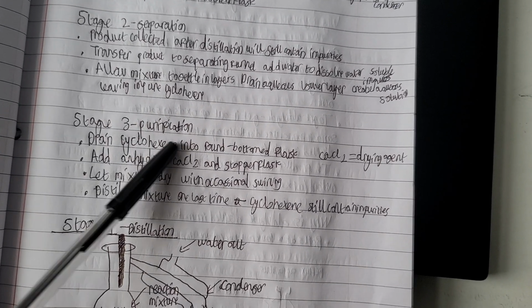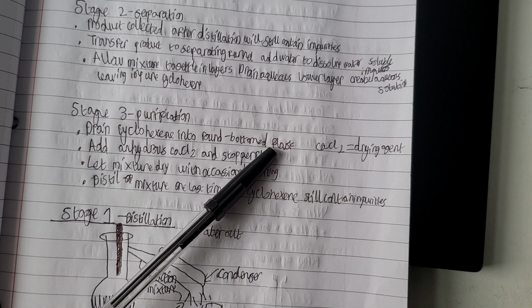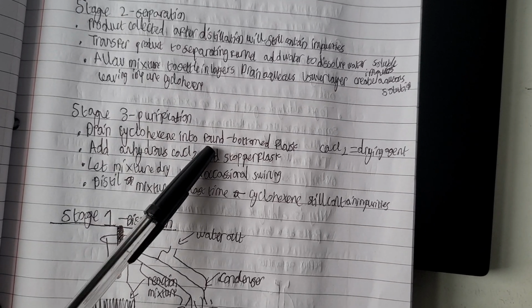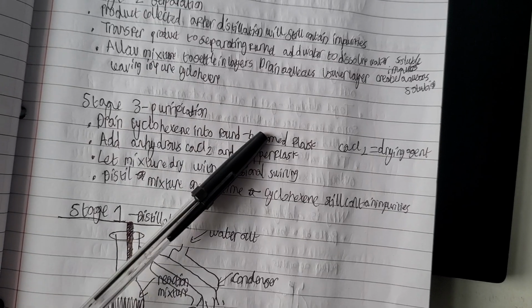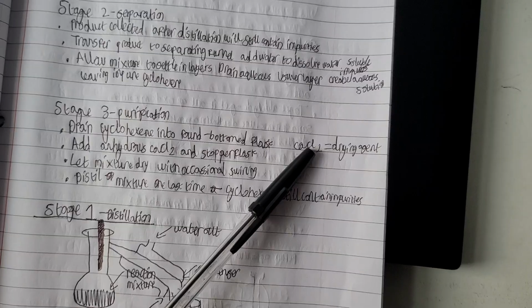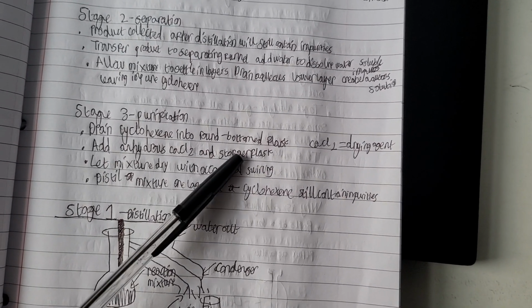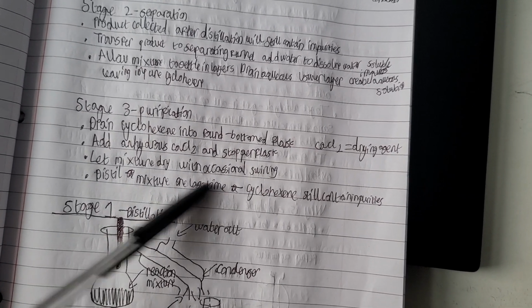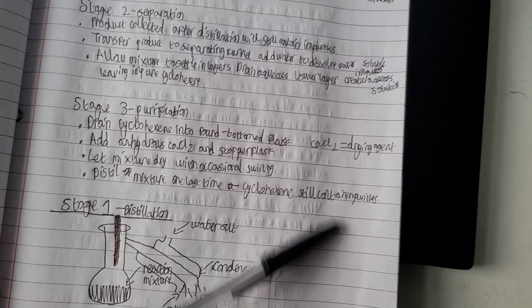Stage 3, purification. We want to drain the cyclohexene into a round bottom flask, because it's still going to contain a small amount of impurities. We want to add anhydrous CaCl2, calcium chloride, an insoluble drying agent, and we want to stopper the flask. Then we want to let the mixture dry with occasional swirling, and then distill the mixture one last time, as the cyclohexene still contains impurities.